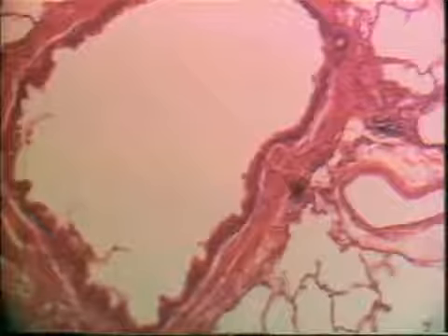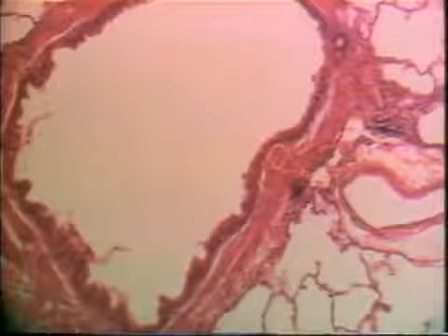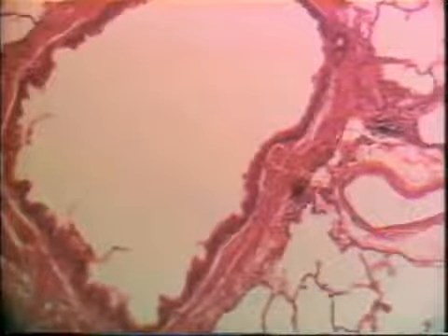That's the bronchiole. The next tissue in the conducting system of the respiratory system is the terminal bronchiole. And I'll show you that on the next section. Three important characteristics to be noted in the terminal bronchiole.